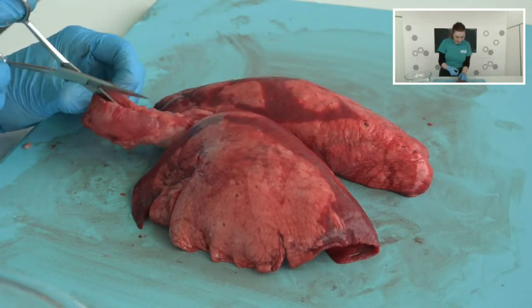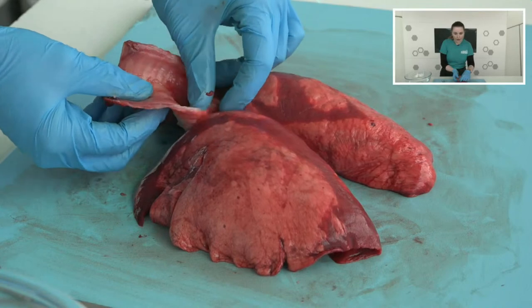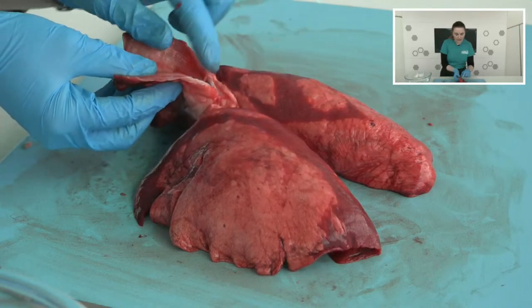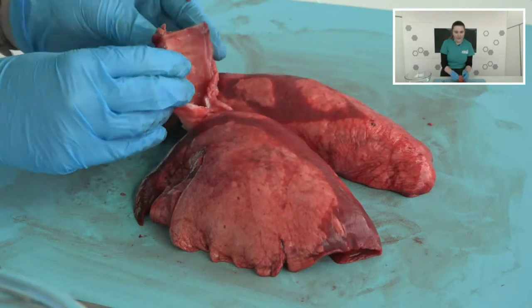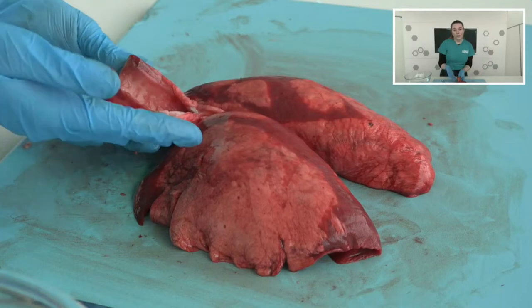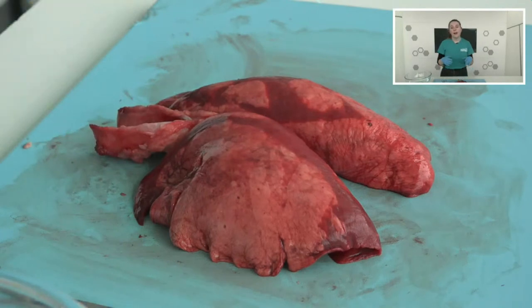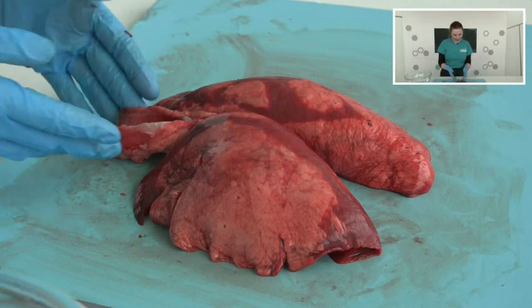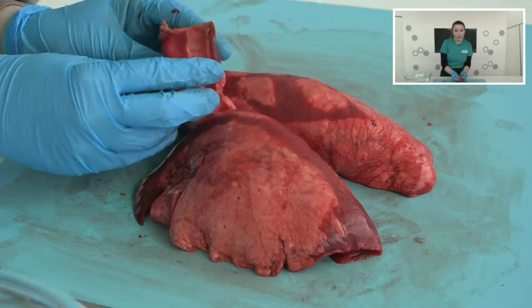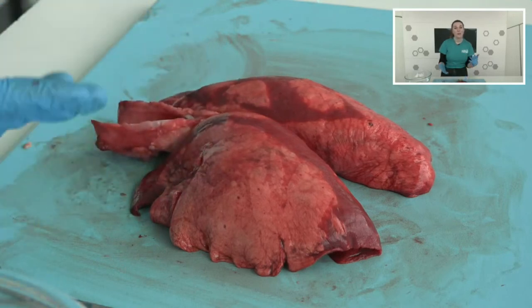As I cut into the trachea, you can see this white, flexible substance — it's quite stiff but also bendy. This is cartilage. It's a substance that isn't rigid like bone — it's nice and bendy. We need to keep our airways open all of the time, but we also need to be able to move and bend our necks. So this way, we can keep our airways open with a nice flexible material while still being able to move around.